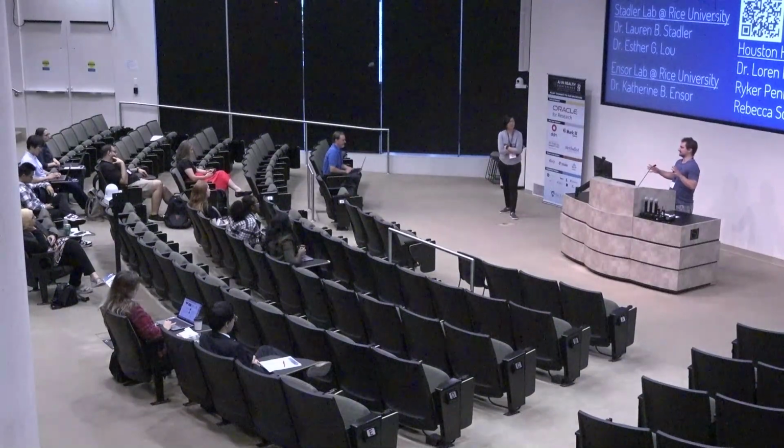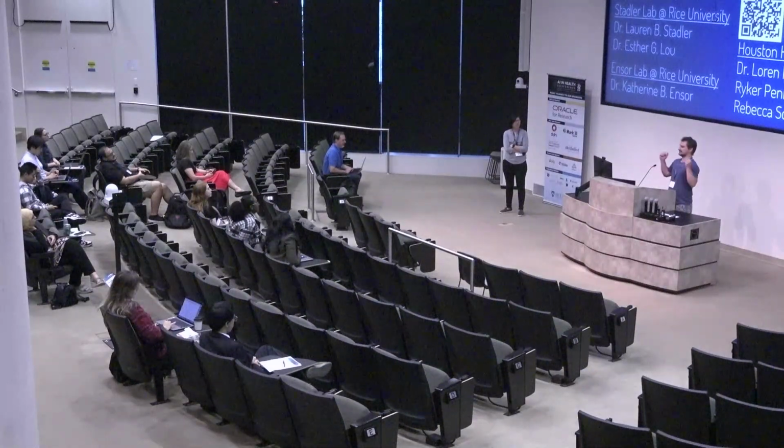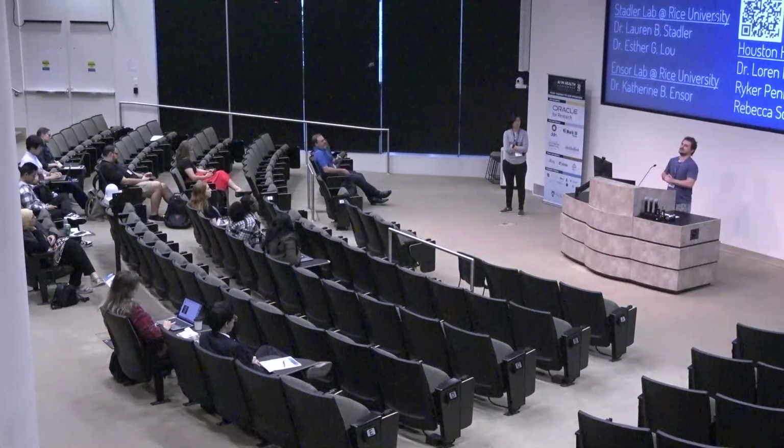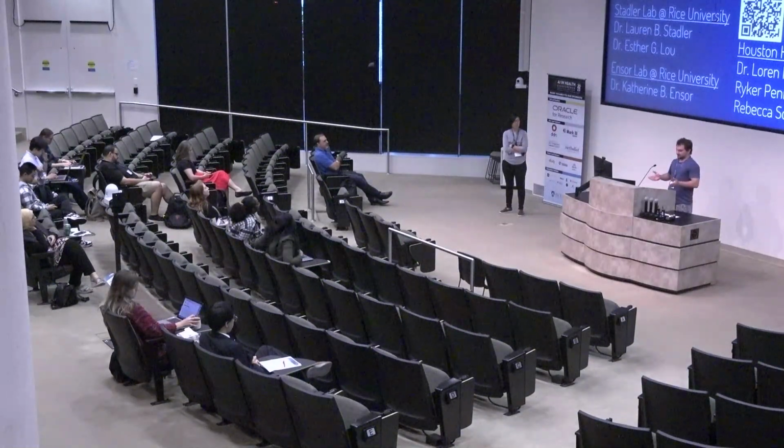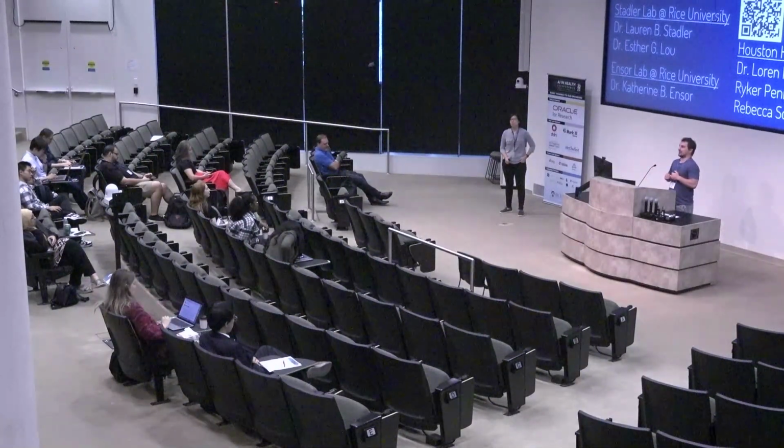Yeah, so this is a very good question, and I'll repeat it for the audience if somebody didn't catch it. Early on, I showed this table, and there's this nice feature that Freya has, estimating relative abundance of these lineages. The question is what it would take to get that information added in here. In our particular case, it's an explicit design choice to not have that information, because we believe, based on our extensive simulation and experience with the data, that reliable estimation of relative abundance is impossible. The data just simply does not allow you to do that by its own nature.